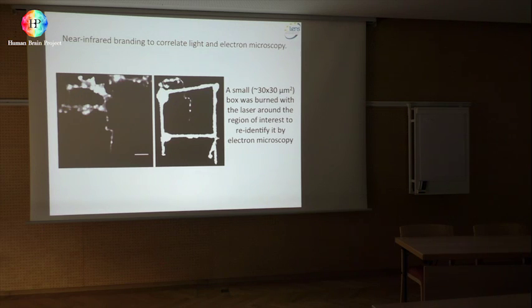But we developed some techniques which are able to scale down and to find in the whole brain exactly this branch with electron microscopy. So it's a complex procedure.